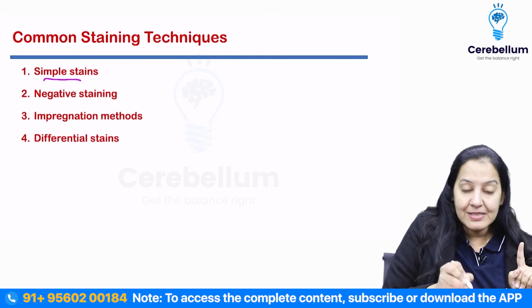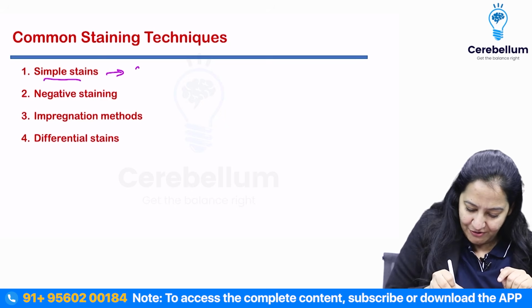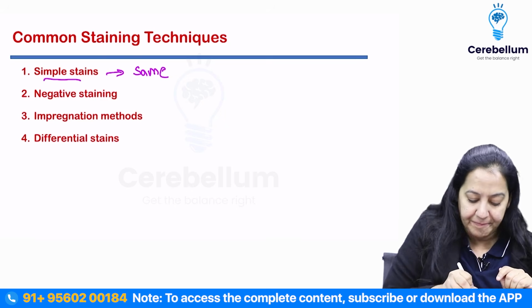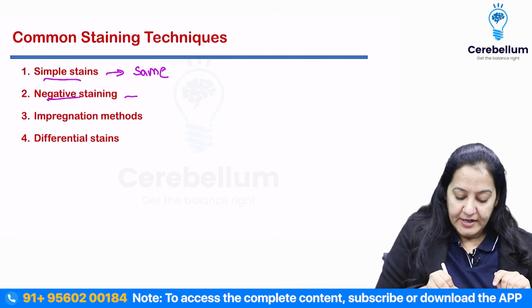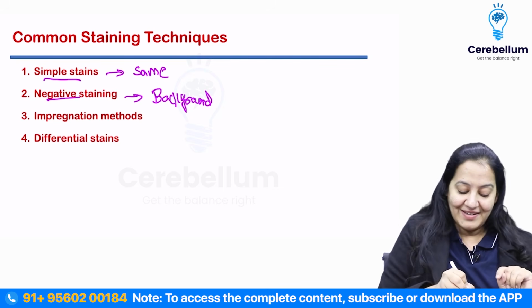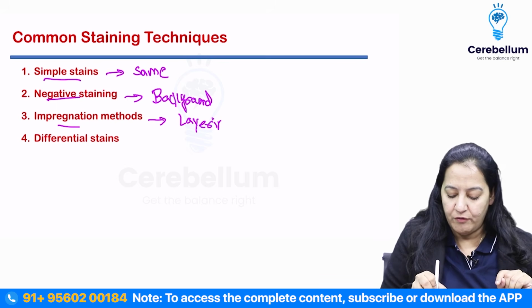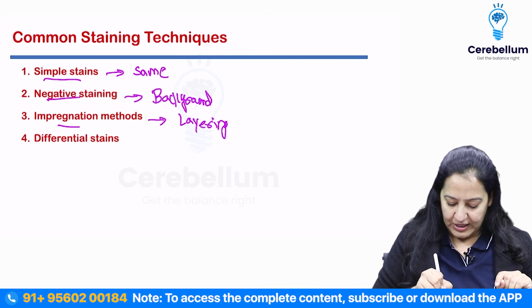The simple stains, which provide the same color to all bacteria. Let me write the definition. Same color to all bacteria. Negative stain: it stains the background but not the structure to be demonstrated, not the bacteria. And the third is impregnation. Impregnation means layering, layer over layer, when the bacteria is too thin, right?